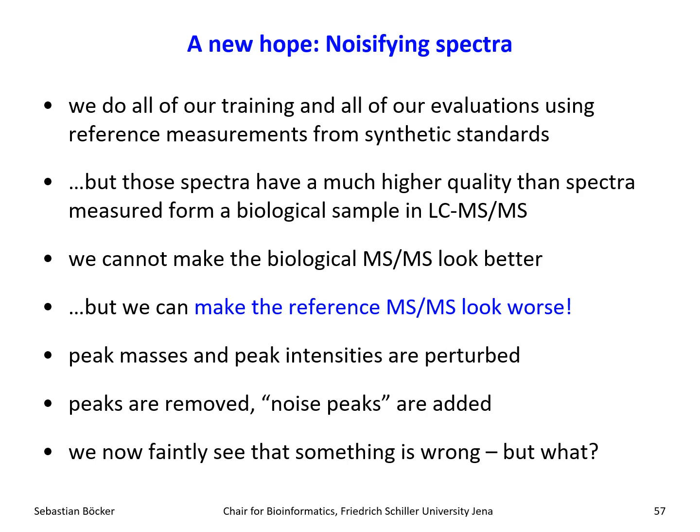But at some stage, we found hints also from image processing that it's a good idea if you noisify your data. In particular for us, this makes a lot of sense because we are just looking at reference tandem mass spectra. So those might be too good.